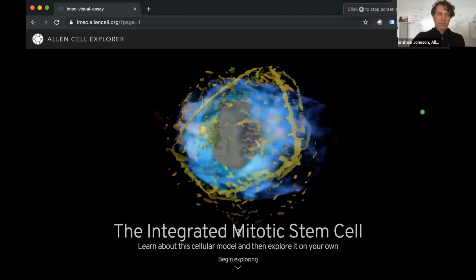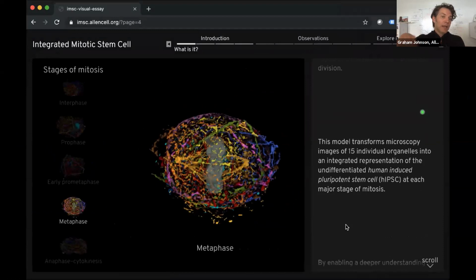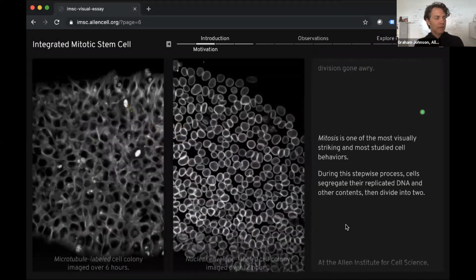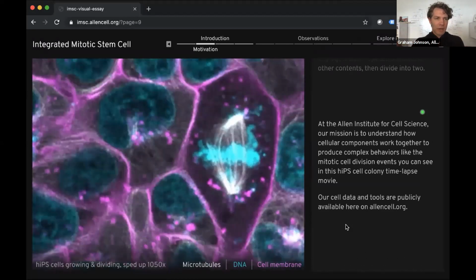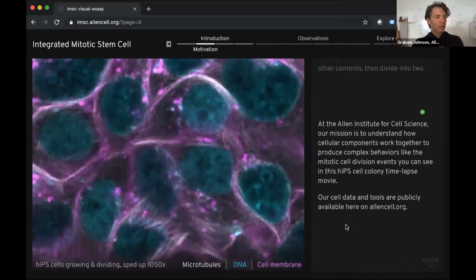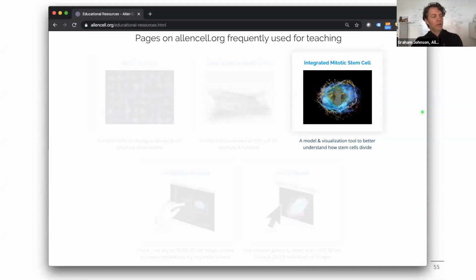And we've built a page, which is about a 20-minute interactive scrolling movie. And at times later in the page, the left side actually has some interactive 3D viewers that you can use to learn all of the stuff that I just told you, taught in a bit more of an educational manner about the type of microscopy we use at the Institute, what our cells look like in 3 dimensions, what it means to take something like this, a bright field image, and to highlight with GFP one of the particular lines inside of it. And so Caitlin will show you some more about that.